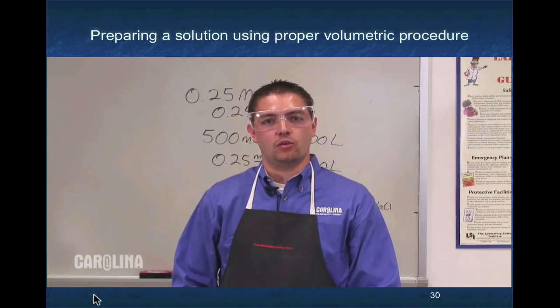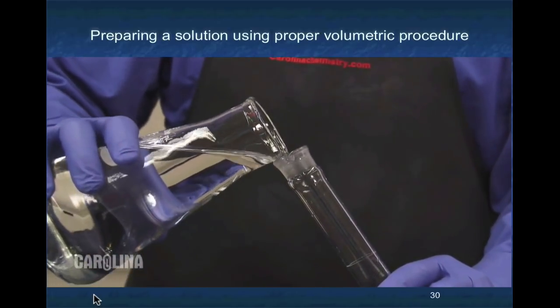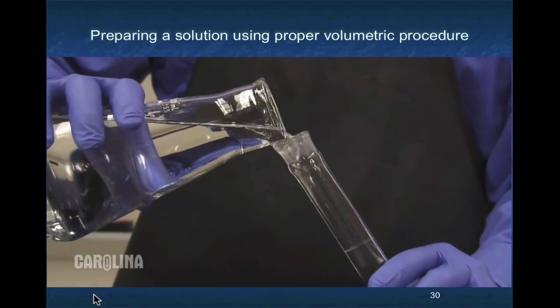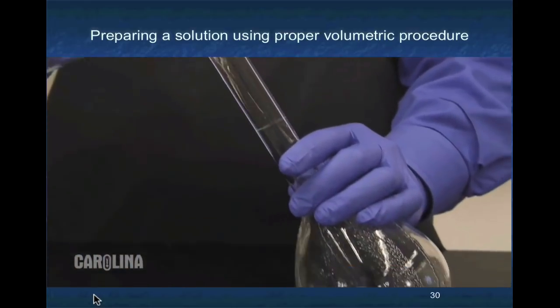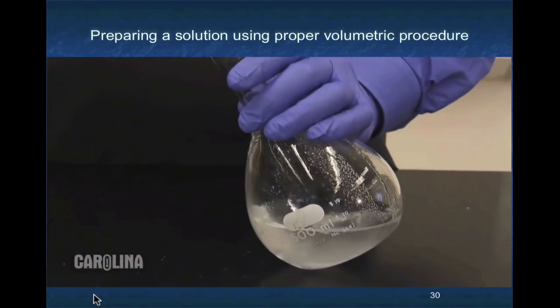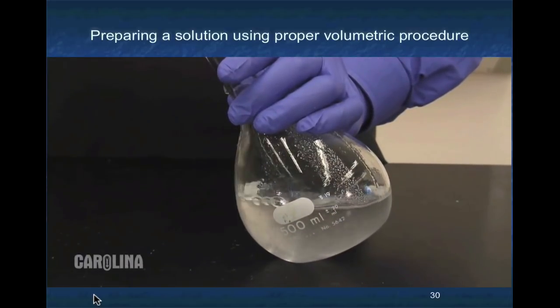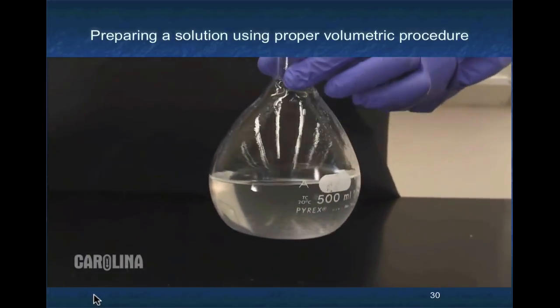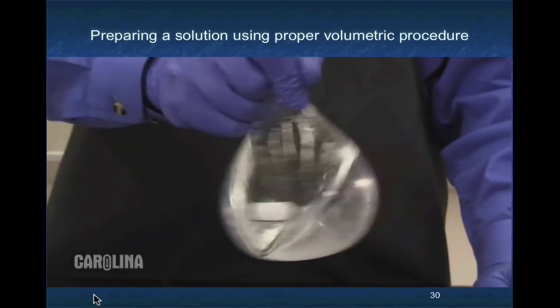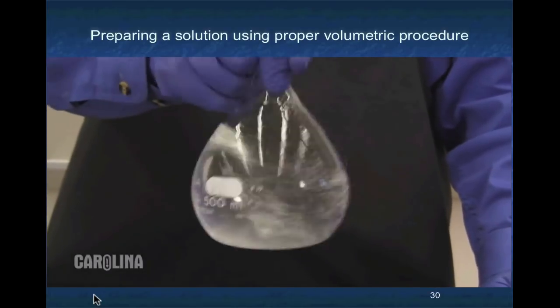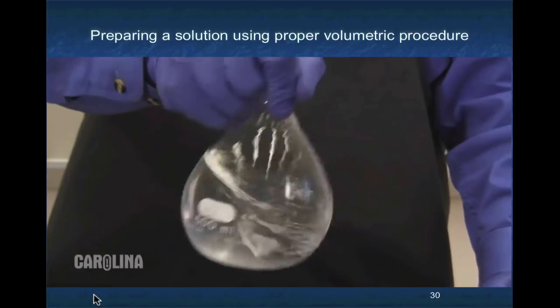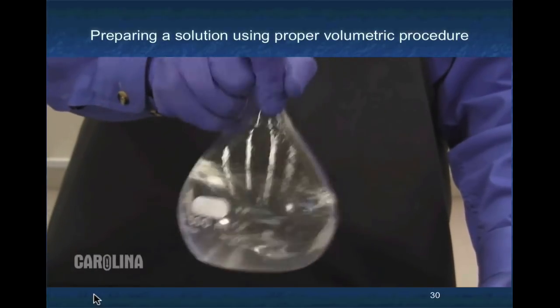If any solute remains on the weighing paper, use a spatula or a small amount of water to transfer the remaining salt. Next, add enough water so that the bulb area at the bottom of the flask is approximately half full. This will give you enough room to swirl the liquid, allowing the solute to completely dissolve. Again, it's critical that all of the solute is dissolved prior to filling to the appropriate volume, as different solutes may take up more volume in solution than their undissolved salts.